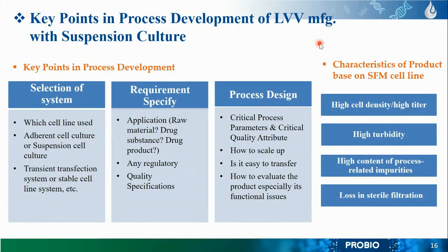Which is very, very important. You actually need to know what kind of material we can use to get the optimized result, when it comes to filters, when it comes to resins, when it comes to the fiber for UFDF or TFF. So these are very important points you need to consider.